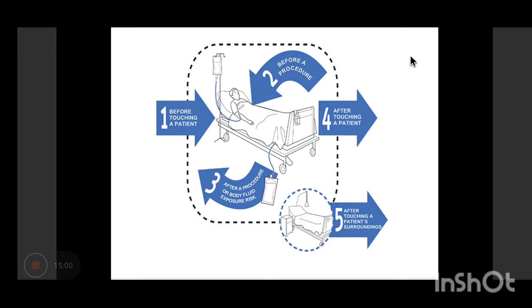Then we come to the surgical hand scrub, or hand wash.